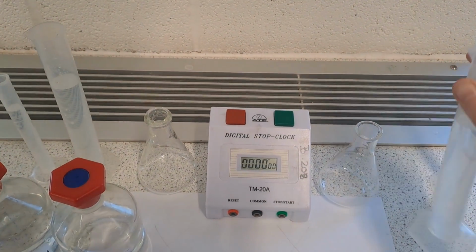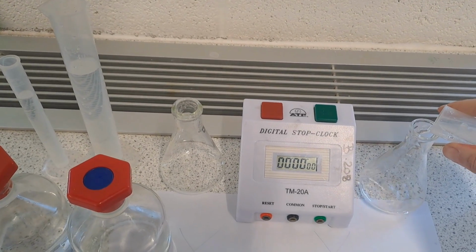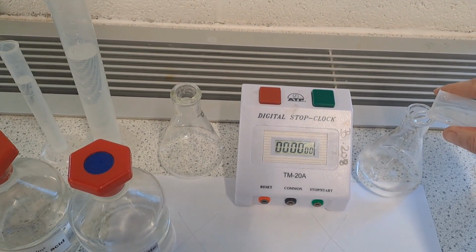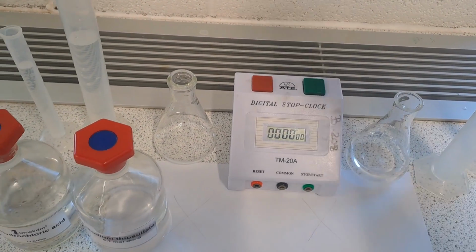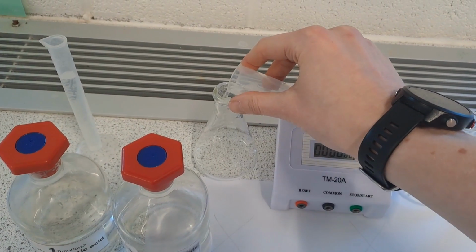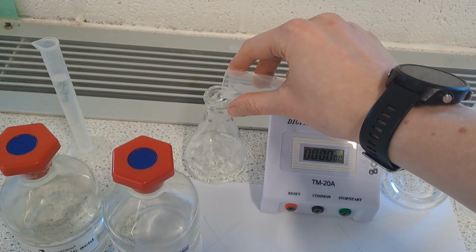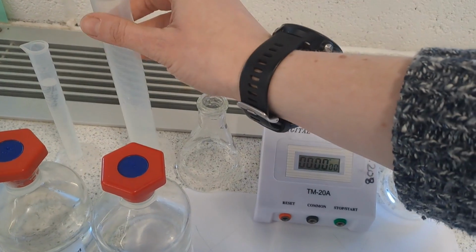So both of those measuring cylinders are going to be decanted into a conical flask, and we use a conical flask just because it's going to mean that any splashing doesn't actually get out of the reaction vessel like it might if we were using a beaker. So both of those are going to go into there, and the reaction won't start, and it won't start going cloudy until I add the acid. So that's the very last thing that I'm going to do.